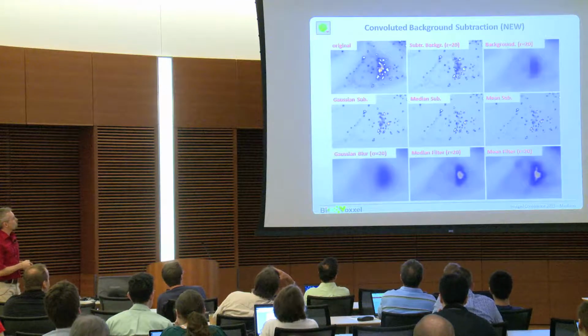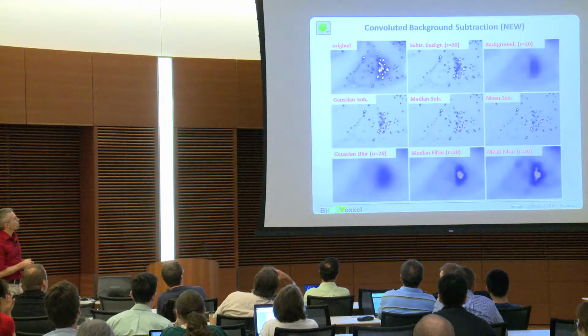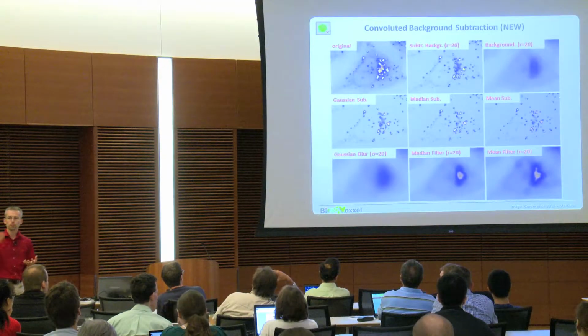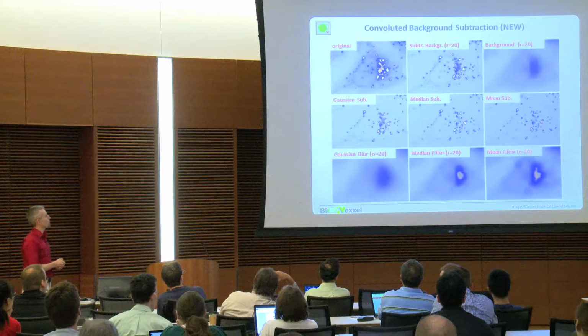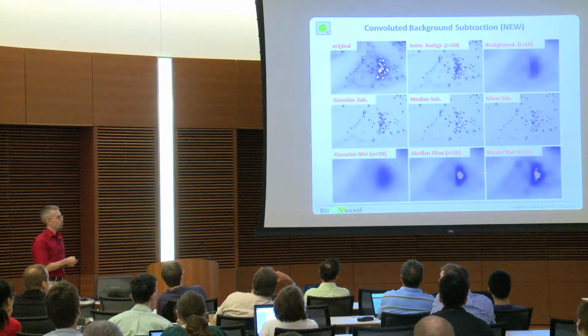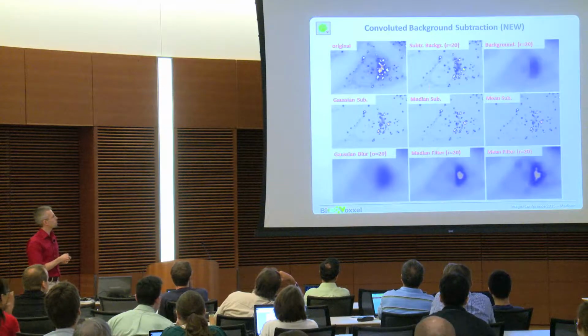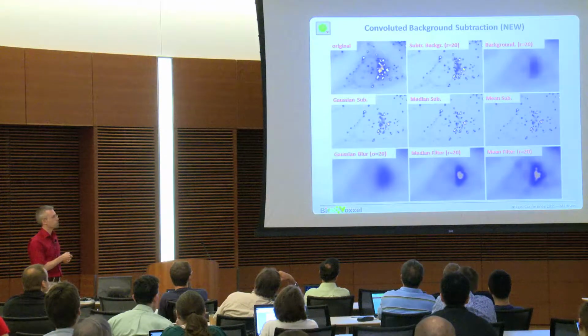So the toolbox now offers a possibility to do very similar things where we can use 3 different functions. This is actually based on these image filters already mentioned. So the background is created by taking the original image and then filtering it with either a Gaussian blurring filter, a median filter, or a mean filter.